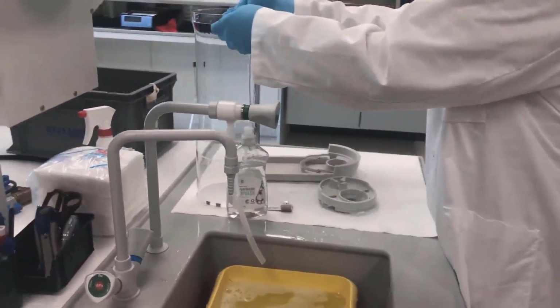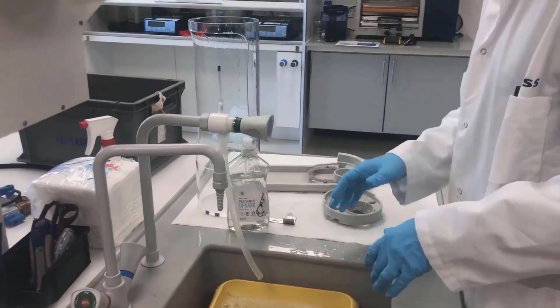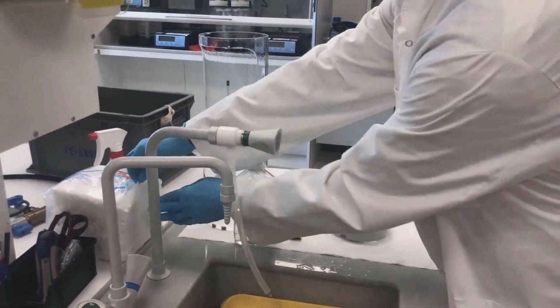Then you can just dry the parts aside, or just use a cloth to wipe them.